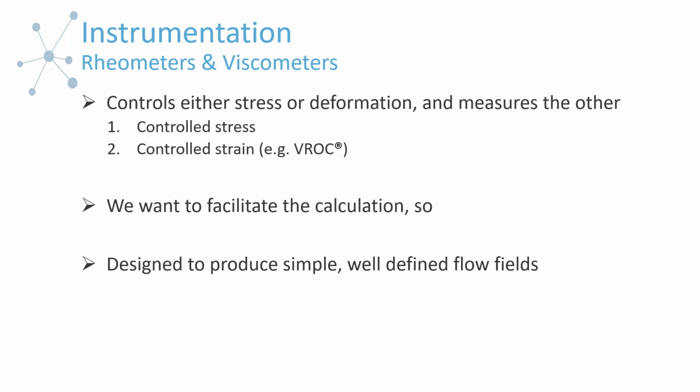And so this is going to be a big factor. They're specifically designed to have these very simple, well-defined, well-controlled flow fields, solely for the purpose of making the whole process of the calculation easy. So let's see why that is. Why is it so important to have a simple flow field when it comes to this type of instrumentation?